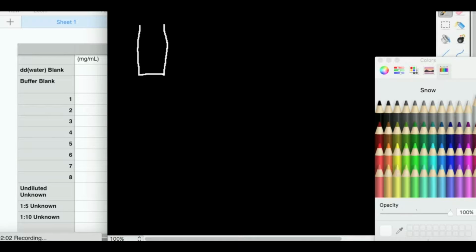So Beer's law basically says that absorbance by something in this sample is equal to the molar extinction coefficient given by epsilon, sometimes also called molar absorptivity, times the path length of the cuvette times the concentration in the sample, and then I'm going to put in parentheses plus a y-intercept, assuming that in the sample you're running in the lab, you have a y-intercept.